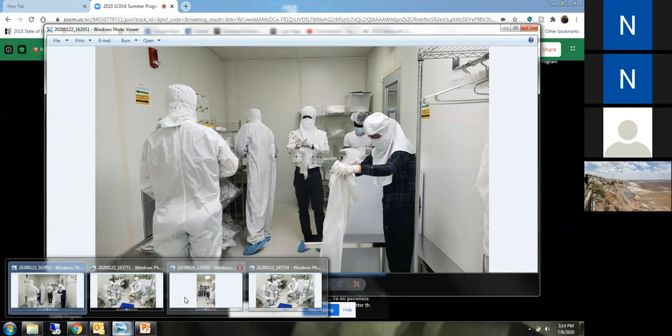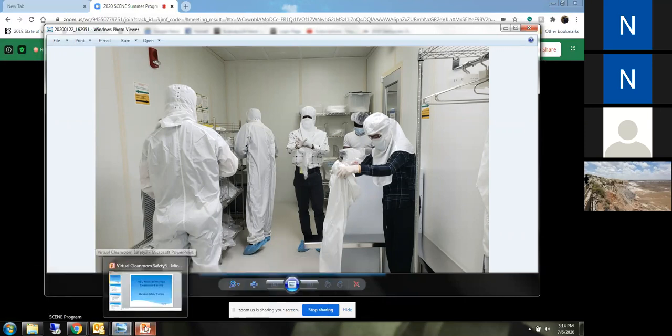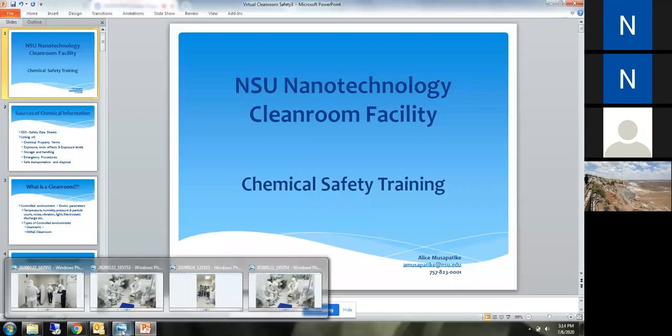Okay, actually there are 2 questions related to the clean room design and airflow. One student wants to see once again the airflow process and the clean room designs, and the other student was asking which one is better, unidirectional airflow or non-unidirectional airflow. So I think you can mix them together and then answer your questions.